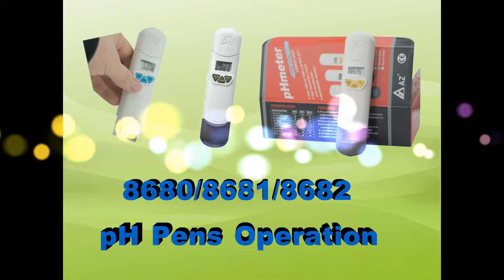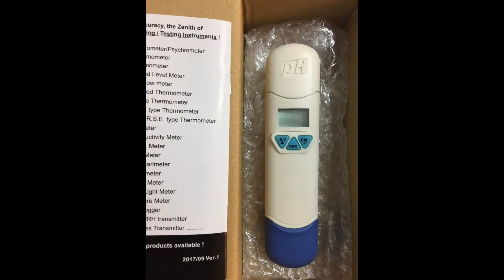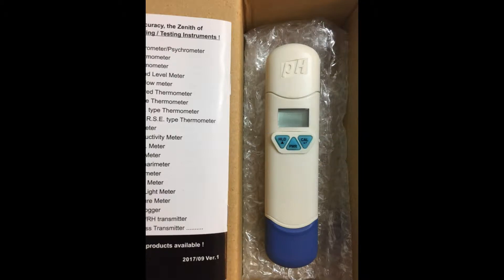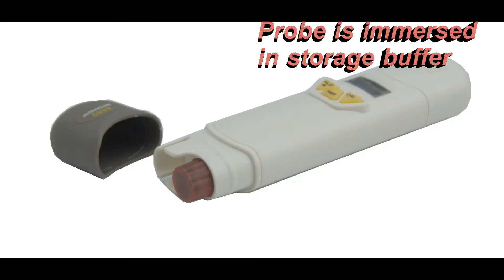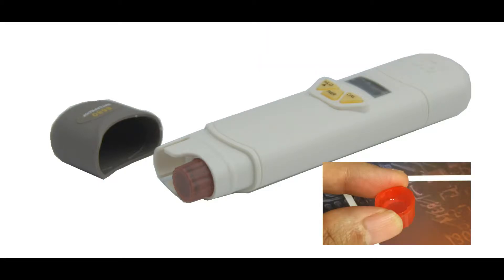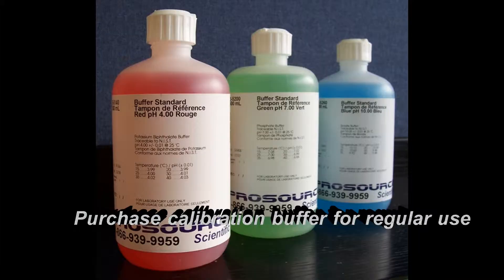AZ PH Pen Calibration, Usage and Cleanliness. The PH Pen comes with 4 LR44 batteries and a manual included in each package. The PH electrode is immersed in storage buffer to avoid drying out. The PH glass bulb should be clean and intact. Calibration buffer can be purchased locally.